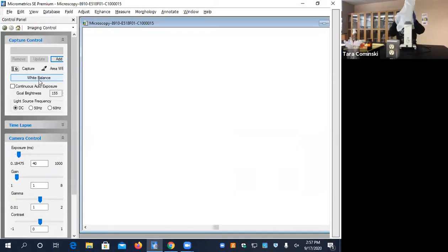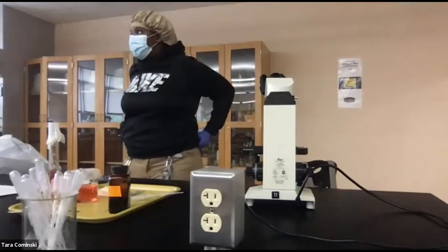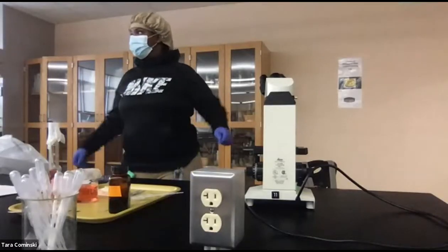Yeah, go ahead. You can take it off. Take that off. You can turn on the microscope. It's not a letter A slide, it's a letter E slide, but anyway, we're not gonna put it in just yet. Let me unshare that because I'm not showing anything. If I want to show you guys something under my microscope, I can show you that way.